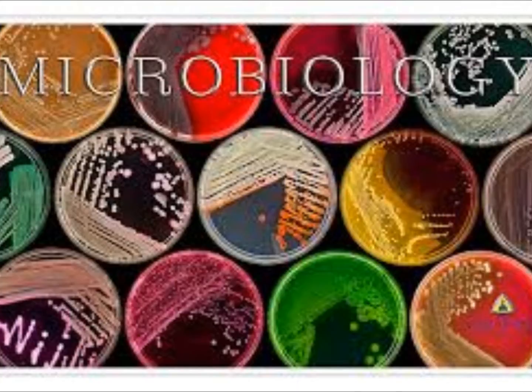And these are tiny pinpoints. She said the glabrata, so you really have a hard time distinguishing if it's clear or white. So this first day, if you don't put it, that's okay. It might be bigger and you'll be able to see the color tomorrow.